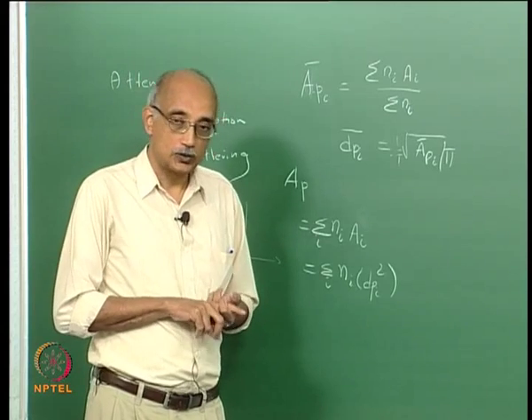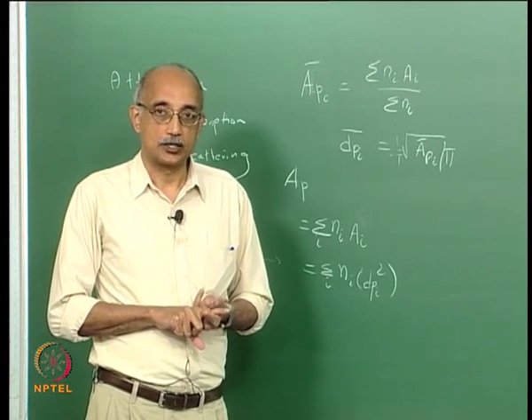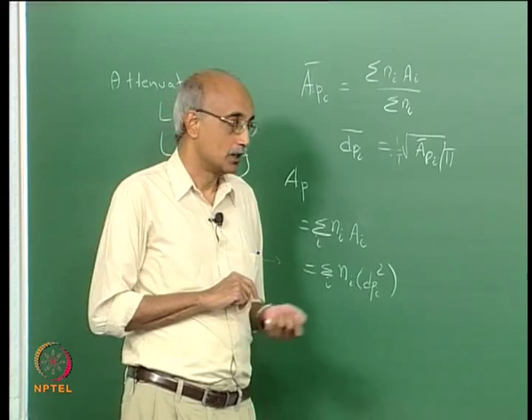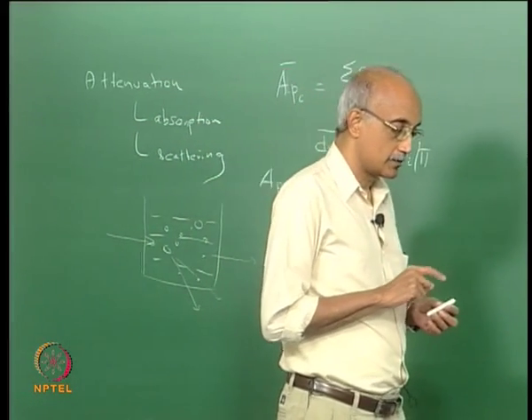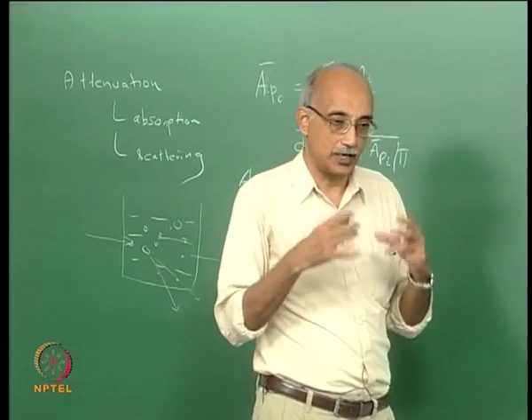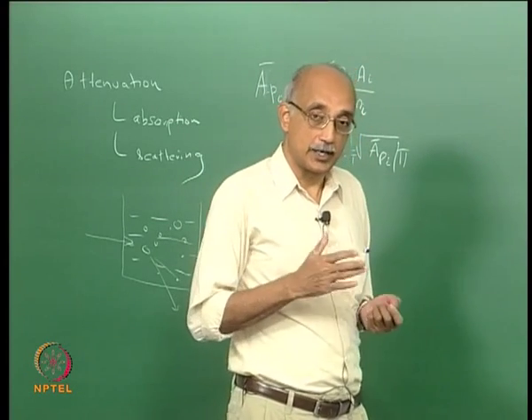If even now that information is not sufficient for you, then you start looking at scattering instruments that are designed for individual particles. So we will begin discussing particularly the scattering characteristics of an isolated spherical particle, because that is really the fundamental basis on which size measurement using light scattering is built.